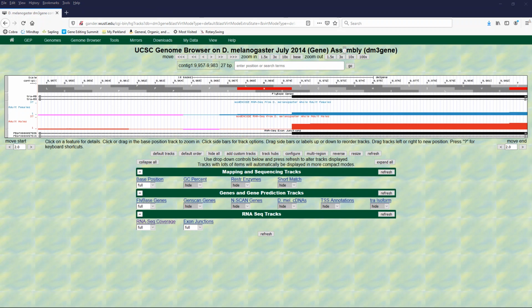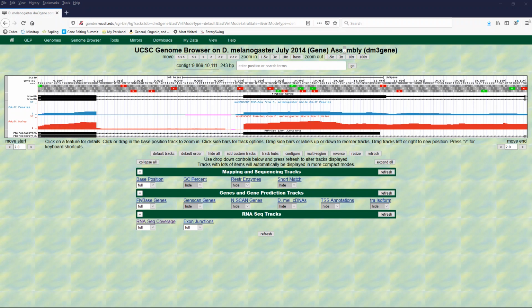Okay, so this is going to require you to first figure out which is the correct reading frame for exon 2. It may or may not be the same as exon 1. All right, so keep in mind phase. So once you figure out the correct reading frame, I want you to find the first stop codon for that reading frame and provide the coordinates for that stop codon. And again, that should be 3 numbers for the stop codon coordinates.